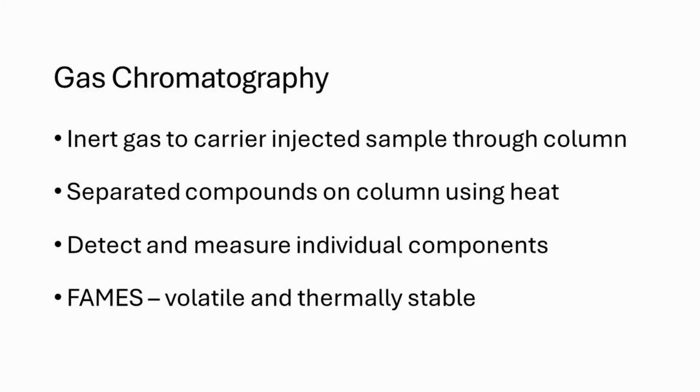Gas chromatography uses an inert gas such as helium to carry the injected sample through a column, where the individual components of the sample are separated using heat. They are then detected and measured. Compounds must be both volatile and thermally stable, which is why the oil is converted into FAMEs.